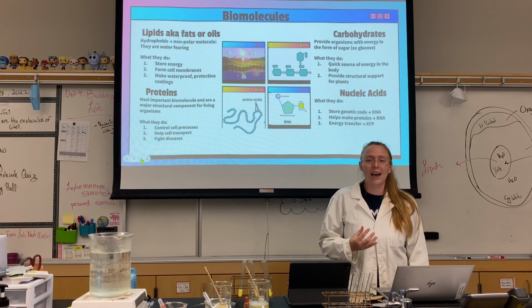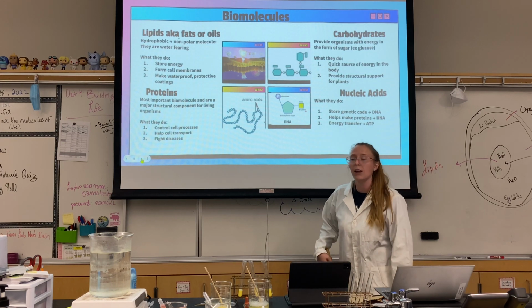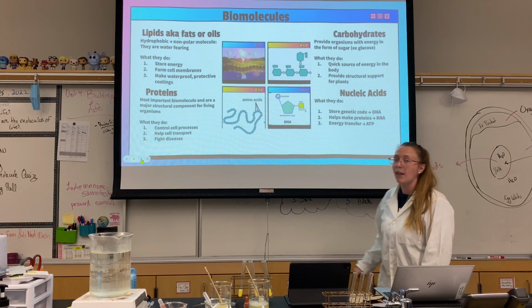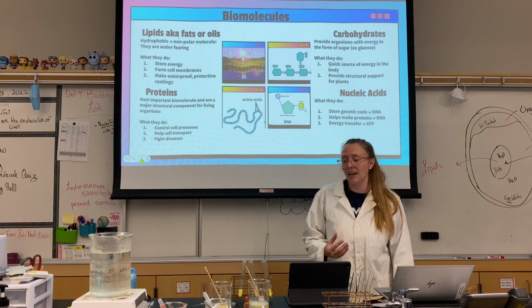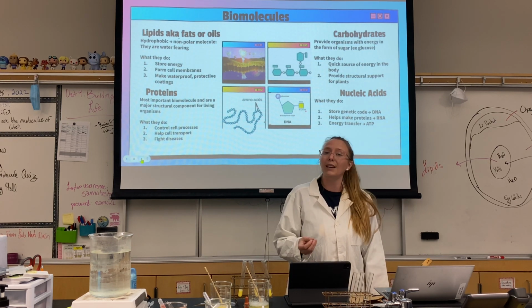So we're going to be looking to see which ones are inside the egg. The only one we're not going to be looking at is nucleic acids, because DNA is going to be everywhere inside of the egg, so we don't really need to look at that.